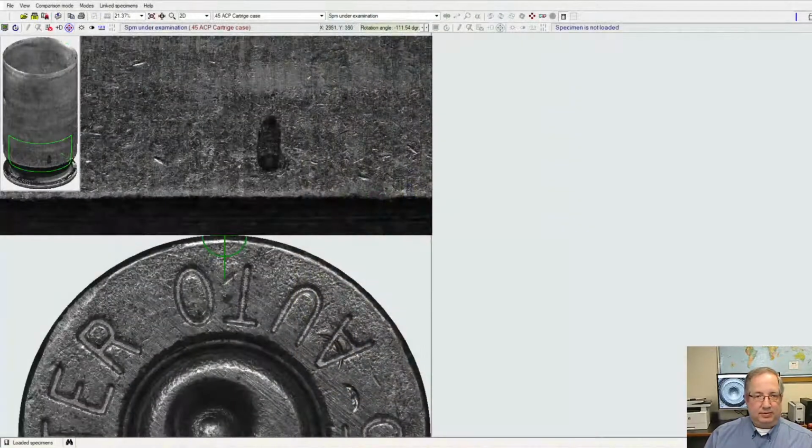The reason I did both of those colors is that I could show you, because we use red LEDs for imaging, that red mark does not show up on the sample. The black mark, however, does. So when we use a label, we want to make sure that we're using a color that is going to be visible by the software, which is pretty much anything but red.